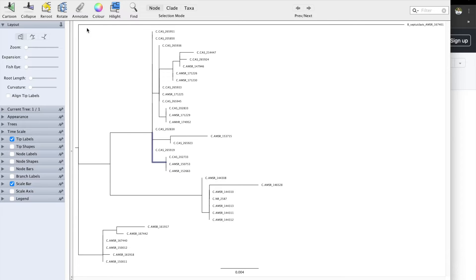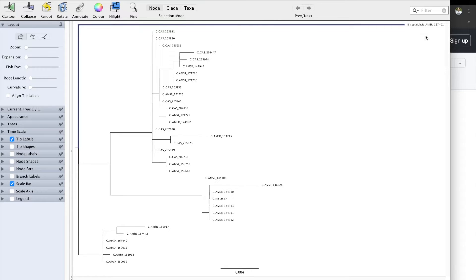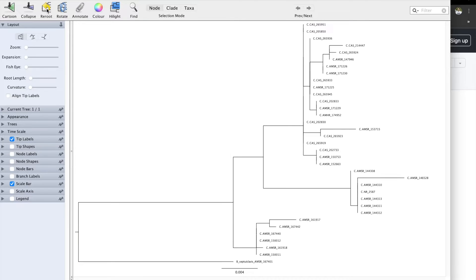Reroot is going to be one of the options that we're going to use all the time. For example, if you have an outgroup — in this case we have Bavai Septu Clavis, which is an outgroup — you can click on it, and it already looks pretty good.